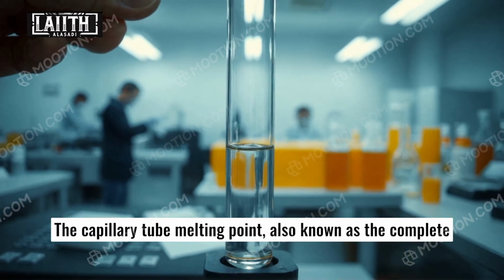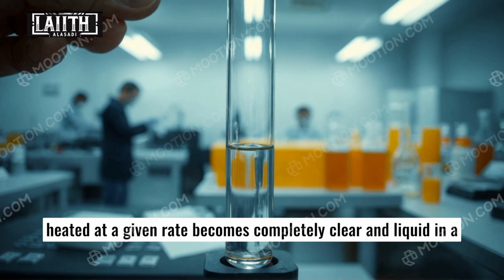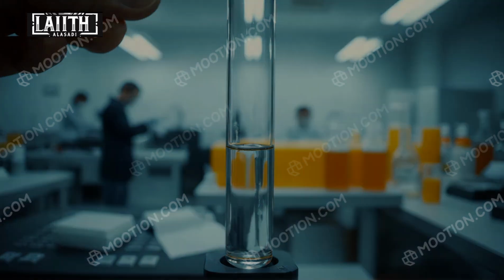The capillary tube melting point, also known as the complete melting point or clear point, is the temperature at which fat heated at a given rate becomes completely clear and liquid in a one-end closed capillary.